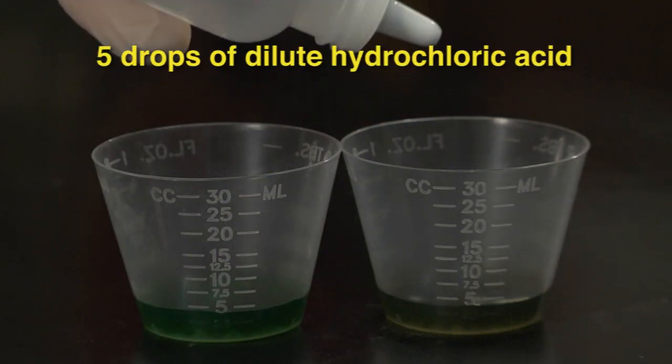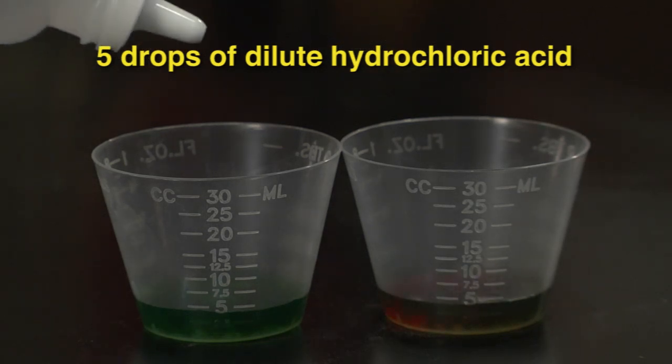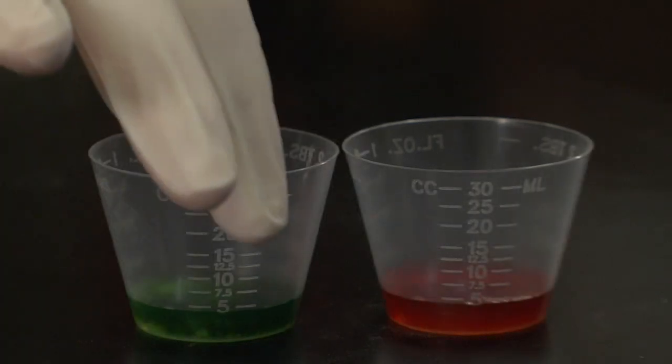Lastly, we add five drops of dilute hydrochloric acid to each beaker, and again, we're going to swirl each beaker to mix it up, and then observe the final result.